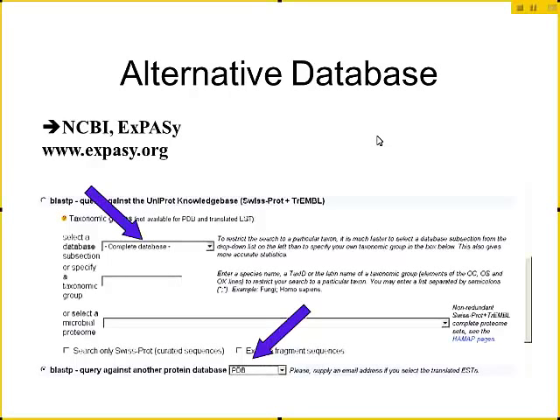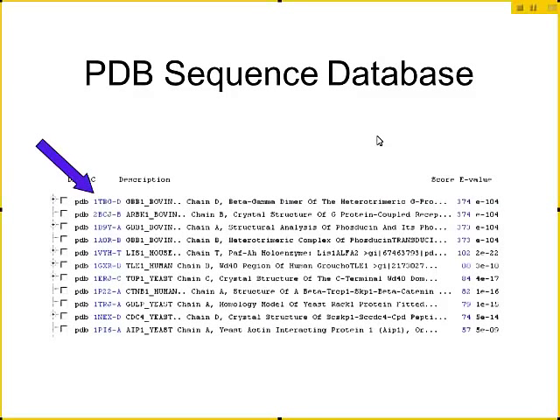I'm not going to address any of that today, but if you have questions, contact me. If you go to this website and search the normal database, you would put that in here. If you're searching the protein data bank, you would put that in at the lower location.